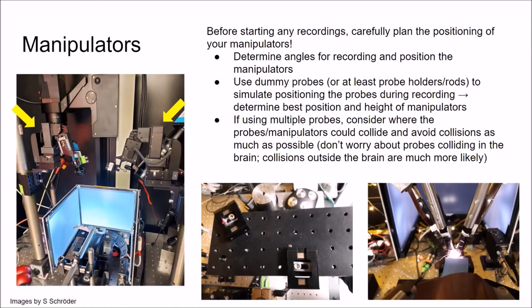If you have multiple probes, really consider where they could collide and then plan it so to avoid collisions. What happens if the probes collide in the brain? I think you really don't need to worry about collisions in the brain. It's much more likely that collisions happen outside the brain where the big hardware is. Here you see an example of a breadboard where we position two manipulators to have two probes in the same hemisphere recording from the superior colliculus. And here you can see four probes positioned in the head, all in the superior colliculus. You can see it's really tight, so you need to try out with your manipulators how to position them. And also you see that each probe is angled in a certain way so that if you go down, they don't hit each other outside of the brain.